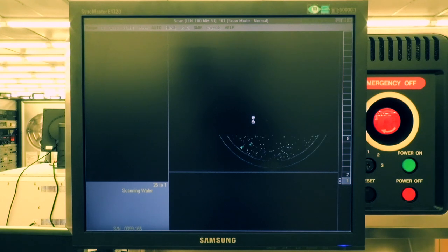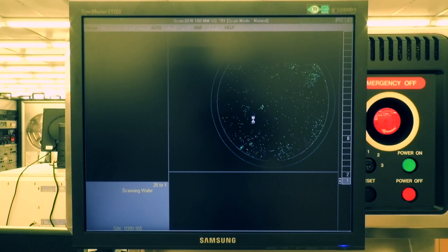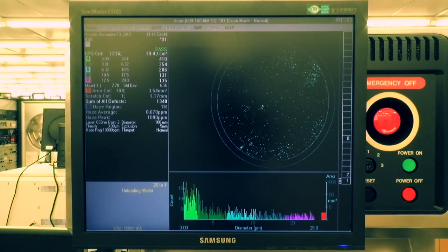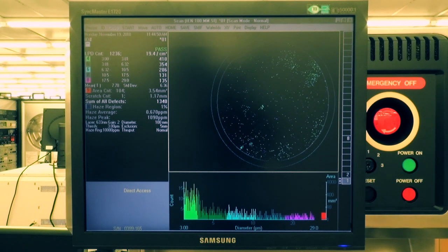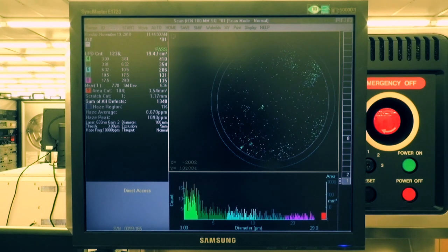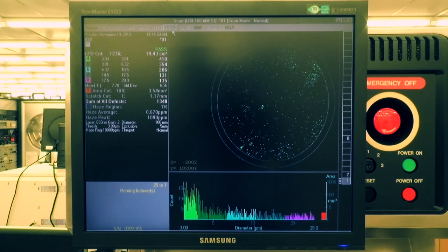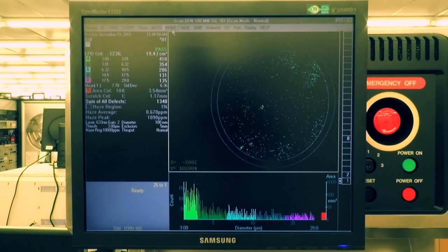When a substrate is scanned, a map and histogram will appear and show data graphically. Record particulate counts and size distribution value for each wafer. If you want to continue to scan another wafer, select another wafer slot number and click Start again. Once your scan is complete, click Home to bring the cassette back to unloading position.